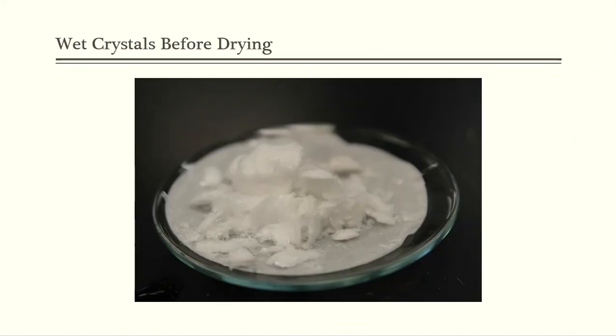So after I removed the filter paper out of the Buchner funnel, I then put it on the watch glass. The reason I'll tell you in just a second, but the watch glass with the filter paper on it, and then you see the crystals on top of that. Again, you see the texture of those crystals completely different than what they were before. Beautiful crystals. I'm going to brag on myself in just a minute. But beautiful crystals that I see here in this image.